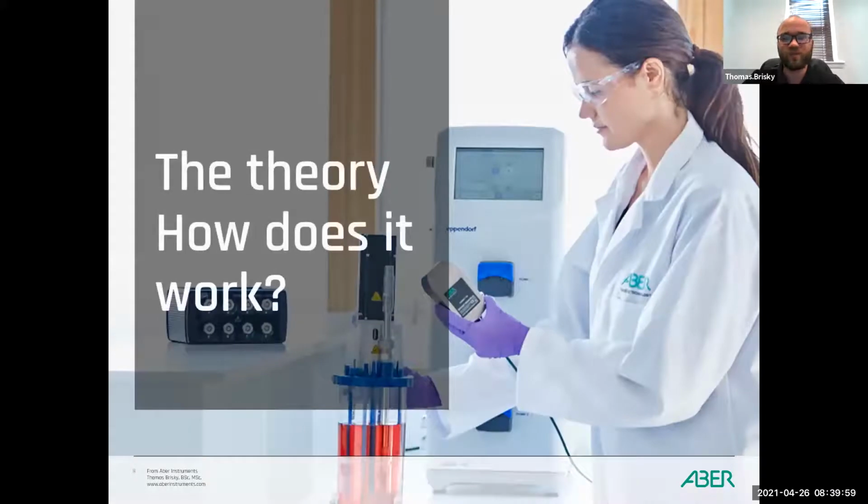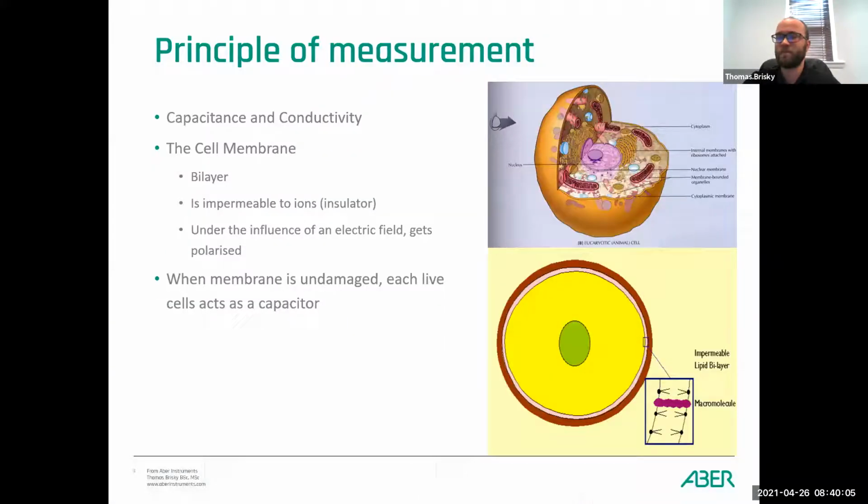So that's another question answered. So we'll move on to the principles of the Aber technology. In other words, how does it work? Aber technology measures two basic parameters. We measure capacitance and we measure conductivity.